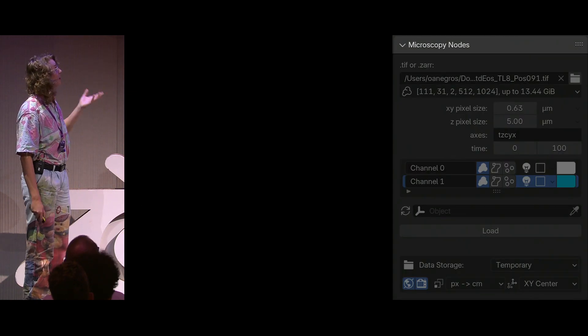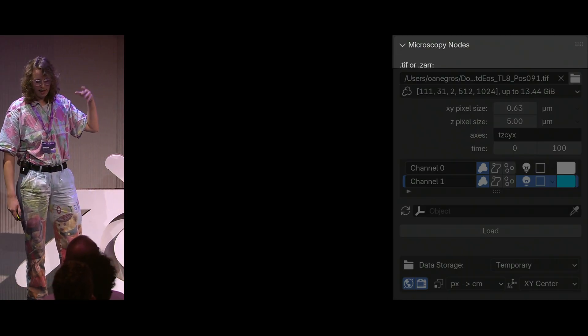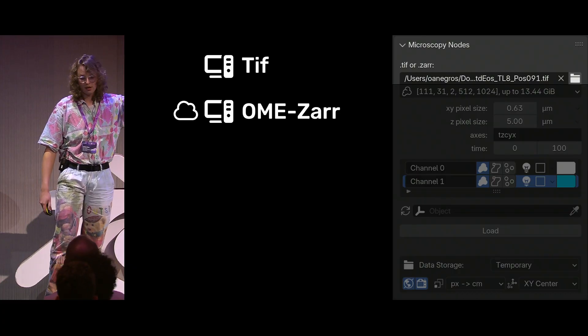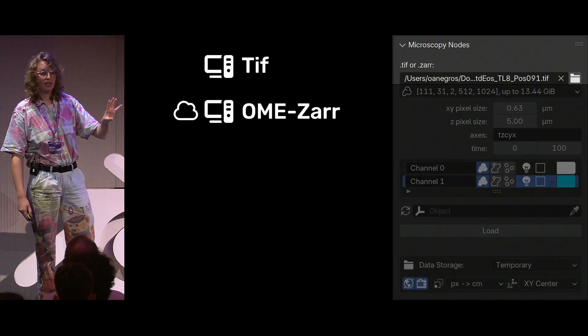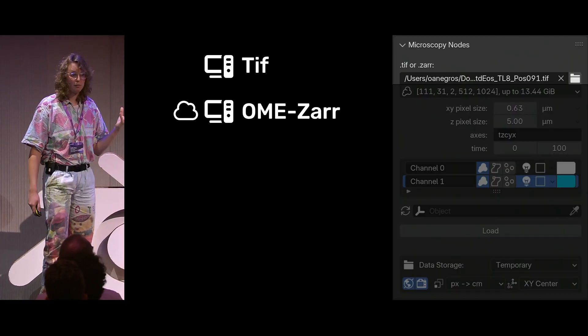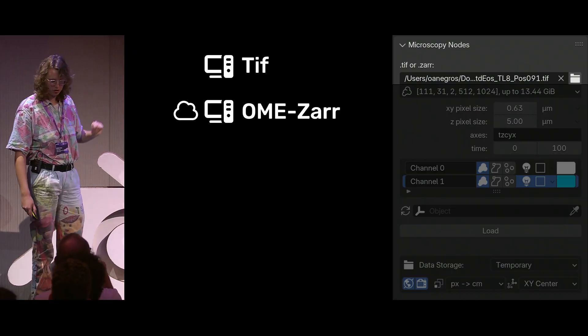So this is a panel that exists in the scene properties. And the first thing you kind of do in there is you load a data set, and that can be from two different formats. That's either a TIFF, which everybody has. It's a very easy format. And then OME-ZAR, which is this developing format that can also live on the cloud, and it has a bunch of other really neat features that I'll kind of touch upon.